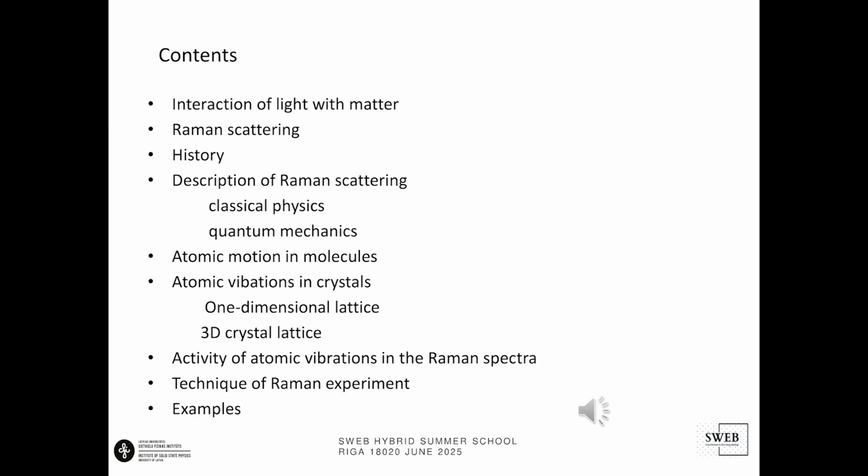Let's start with the interaction of light and matter. Next, we will continue with the physics of Raman effects and the physics of atomic vibrations in matter. Let's conclude with the Raman experiment technique and some examples of experiments.